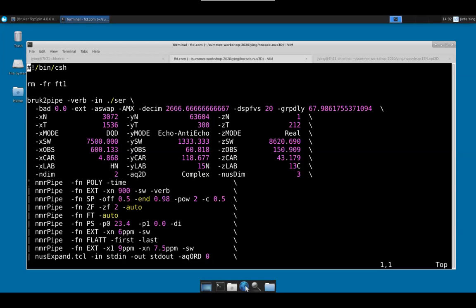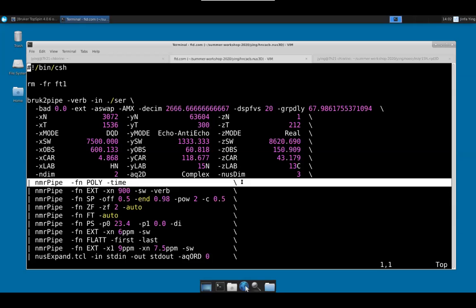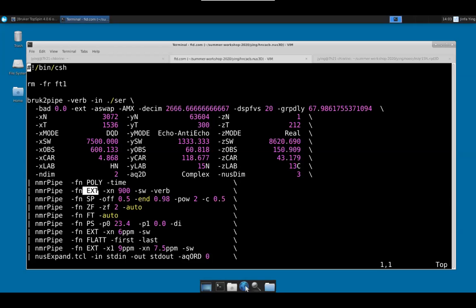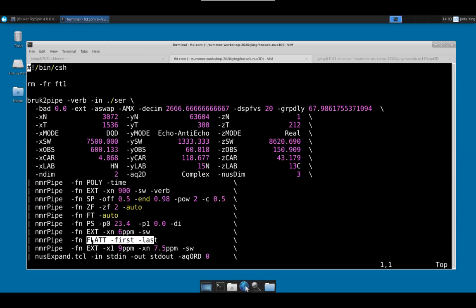Then you can follow it up with regular conventional processing of the direct dimension. First, in the time dimension, you remove the 0 frequency for water. In this case, I collected too many data points, so I cut it down and also applied the window, and then regular processing. I use a flat to do baseline correction in the direct dimension, and then I extract it.